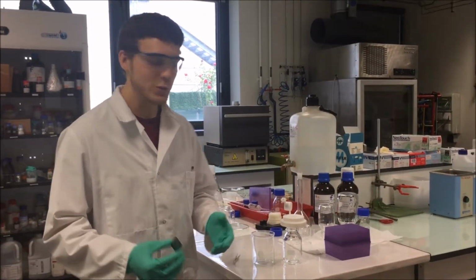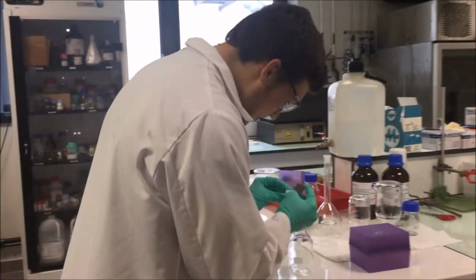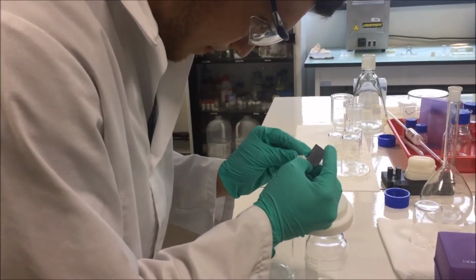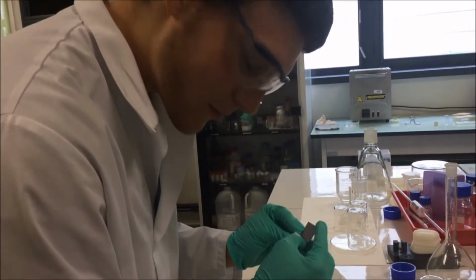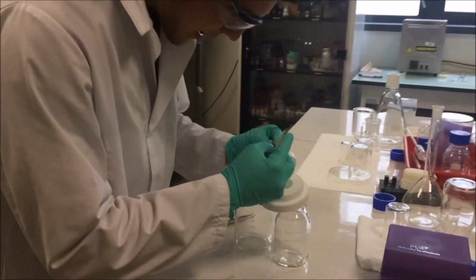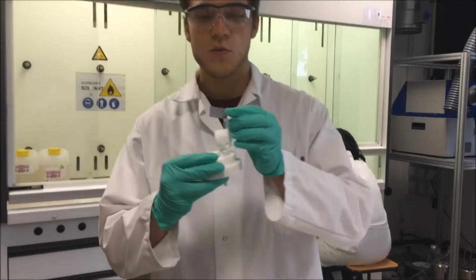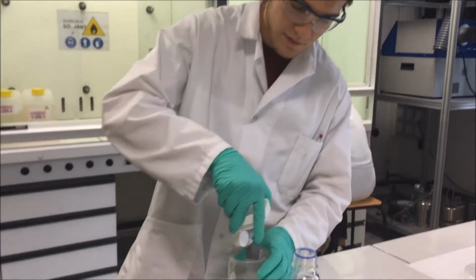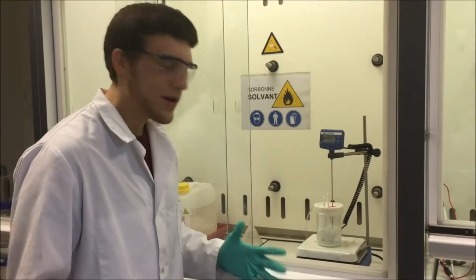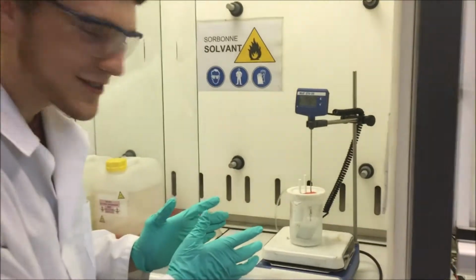Alright, so now that we've taken it out of the oven, we're just going to load it into our fancy-dancy sample holder. Expertly engineered with 3D printing. And once our sample is mounted, we now just invert it into solution and let it grow. And we heat it up, we let it stir, and nanowires are growing right before our eyes.